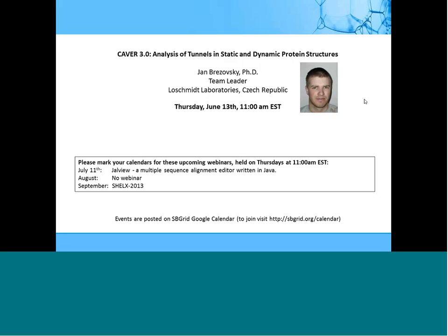Yeah, and this plugin does not have the advanced data output. Is that correct? Like the tunnel radius and those sorts of parameters. Okay, so basically when you run the Caver calculation by the Caver plugin, it's actually calling the Caver standalone. And in an output directory which you define, numbered output directories are created, which contain all this information.